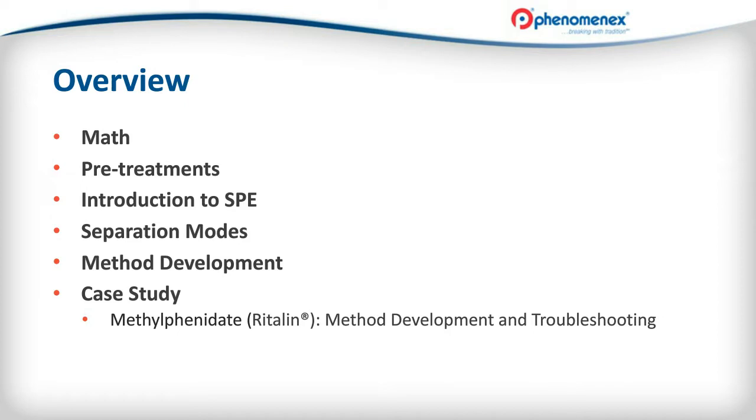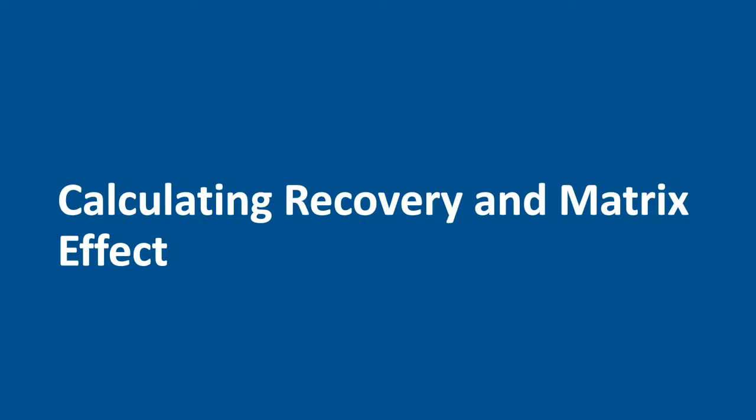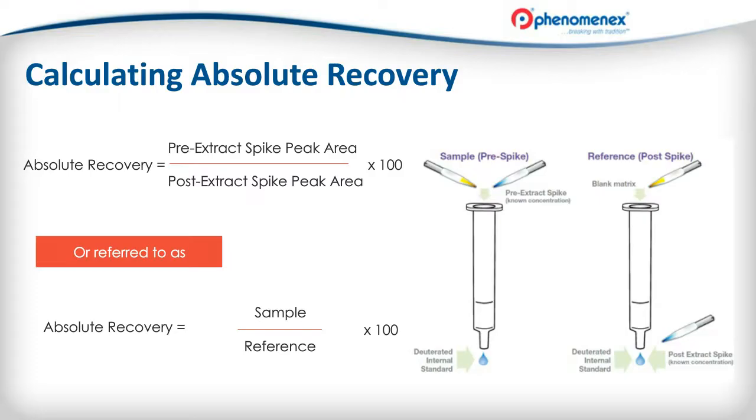The thing that I think is important to do is make sure that everybody's speaking the same language before we get involved with method development. Calculating absolute recovery is very important to do correctly. What we're showing in this particular slide is that it is important to make a matrix match standard in order to understand how good your recovery results are. I know that was the highest responding answer for one of the poll questions.